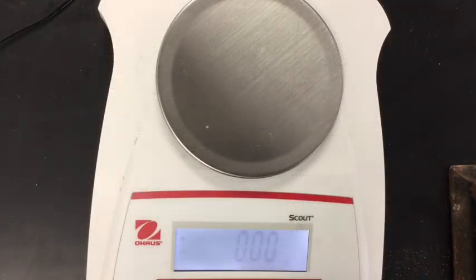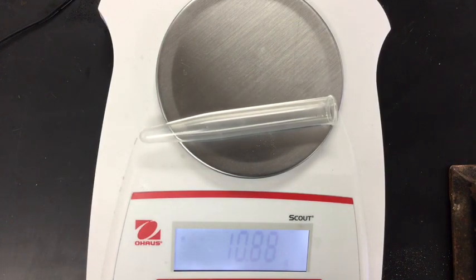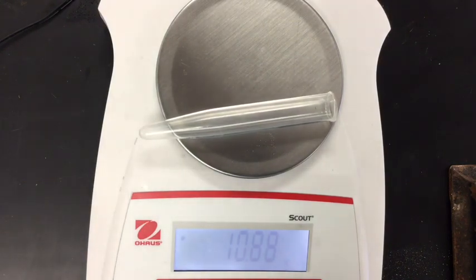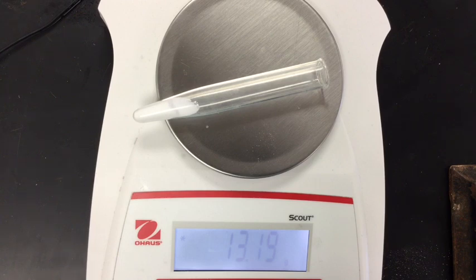Let's get started. We're going to take our test tube, which says 10.88 grams, and fill it with between two to three grams of solid potassium hydrogen carbonate. Now we've got our test tube filled with the potassium hydrogen carbonate and it now says 13.19 grams. Make sure to fill that in on your lab sheet.